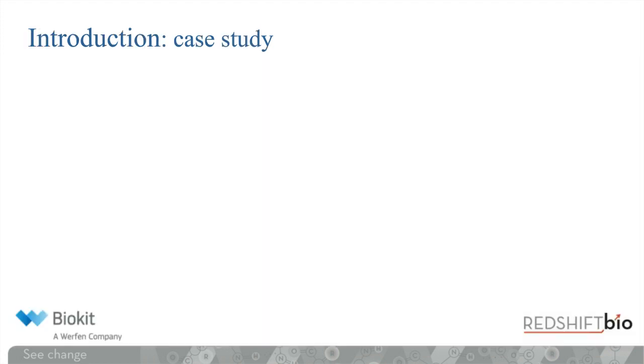Now, today I will be presenting a case study of one of our major raw materials, bovine serum albumin, which is better known as BSA. BSA is a globular serum protein of 66.5 kilodalton, which is sourced from animals, and it is widely used for the development of IVD reagents. Typical applications include the use of BSA as a stabilizer or as a blocking agent.